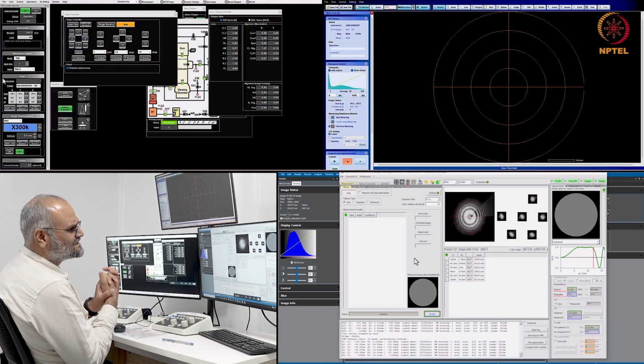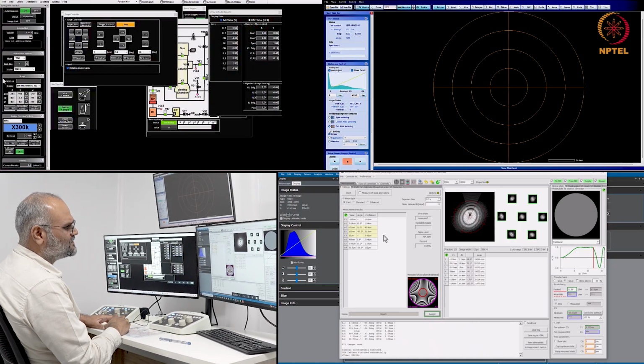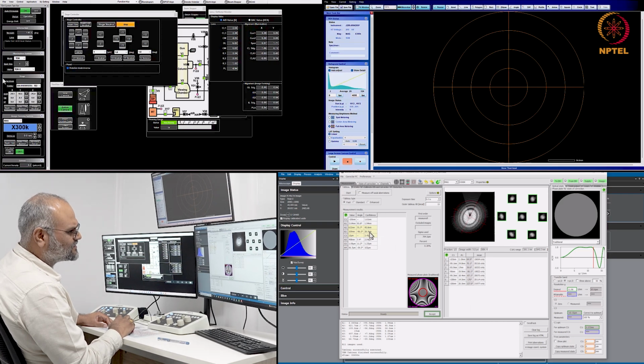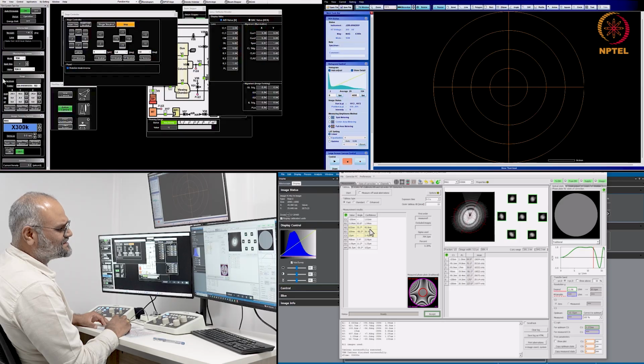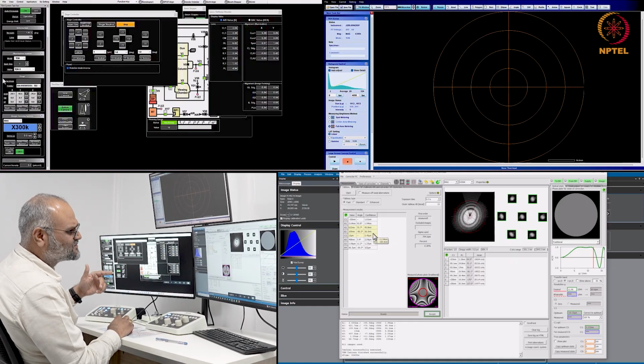and you can see that there is some coma here. So based on whatever the software suggests here on the confidence values, please bear in mind that all of these can sometimes be very accurate, or sometimes they can be misleading as well.